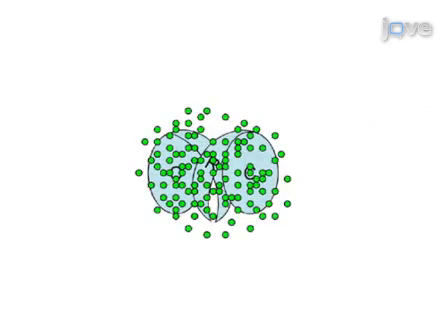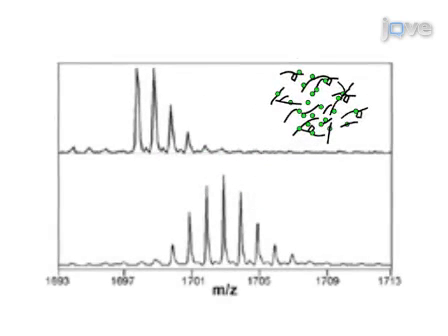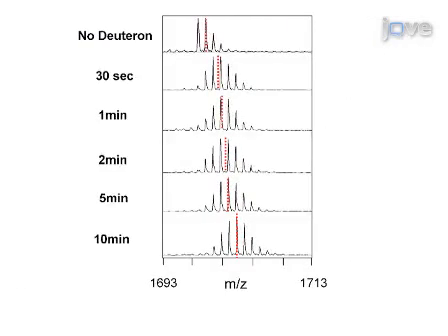Proceed to analyze hydrogen-deuterium exchange patterns of PAK2 by MALDI-TOF monitoring of the deuteration level of each PAK2 fragment. The precise level of hydrogen-deuterium exchange using MALDI-TOF analysis provides important insights into caspase 3 cleavage and autophosphorylation of PAK2. This method can help answer questions of protein dynamics, such as protein conformational changes, protein-ligand interactions, and protein-protein interactions.